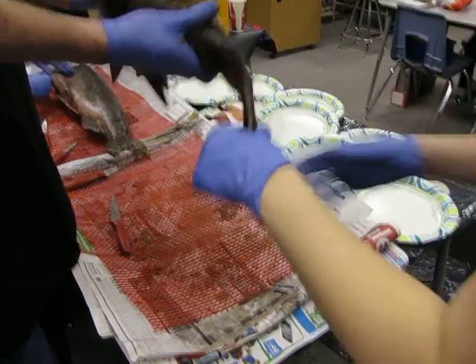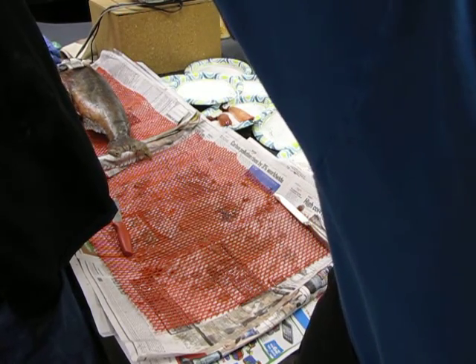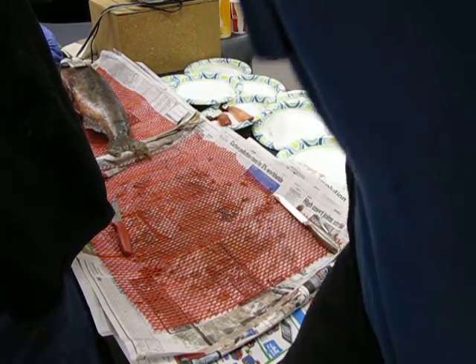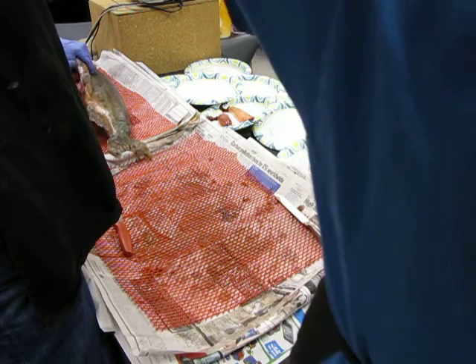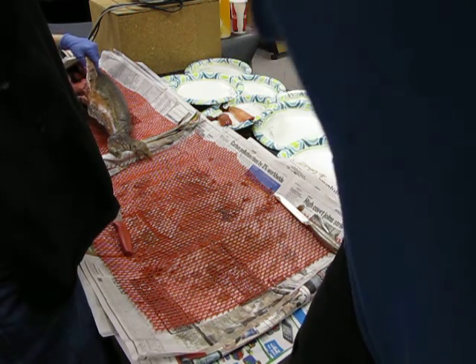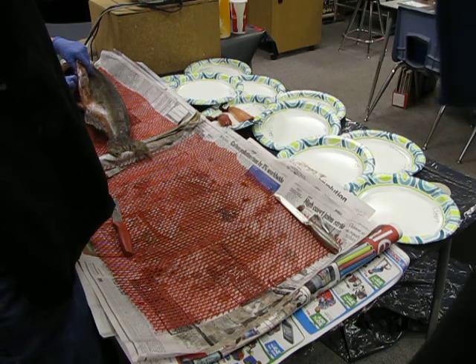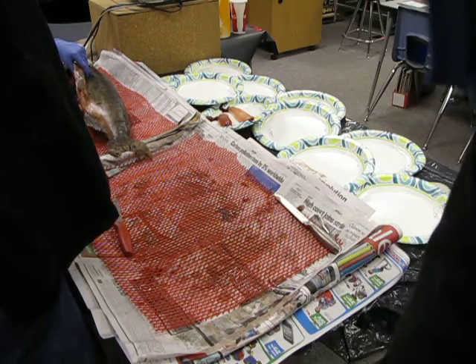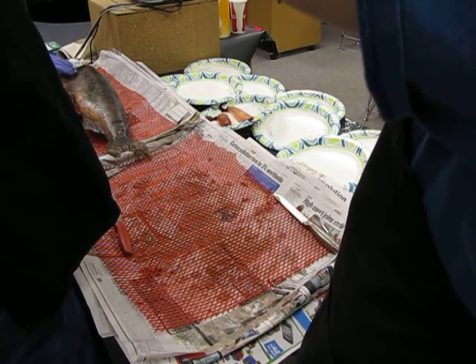Exactly. What about this fin back here? The biggest fin on the salmon. What's it called? Yeah, when they swim, it actually helps them to swim and move. So it goes back and forth. And this fin is called the caudal fin. Can you say caudal? Caudal fin, the tail fin. So it moves back and forth, and that's what actually makes them swim. If you ever see fish swim and they go in a little wiggly direction, it's because when they swim, it's making them wiggle back and forth as they move forward. This is the biggest fin. It has some bones in it too.